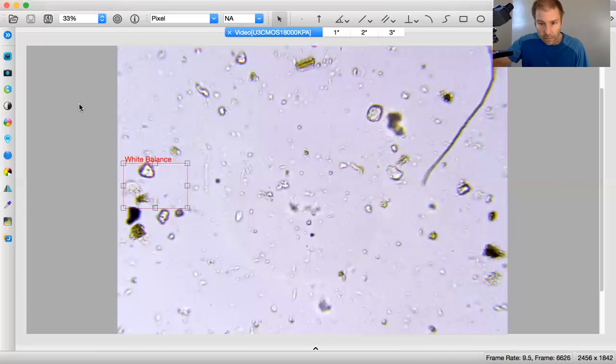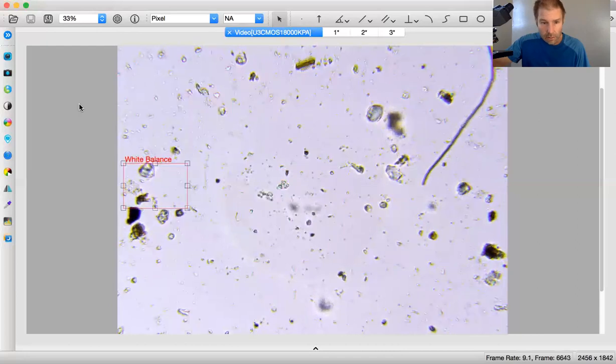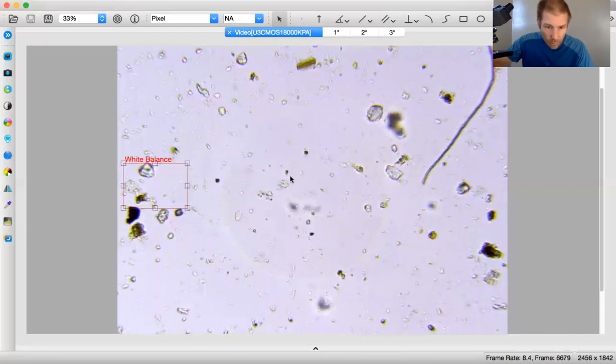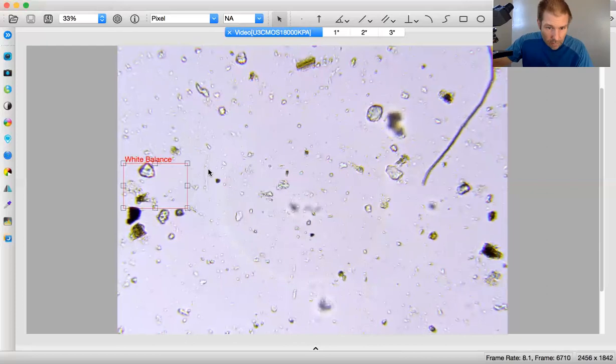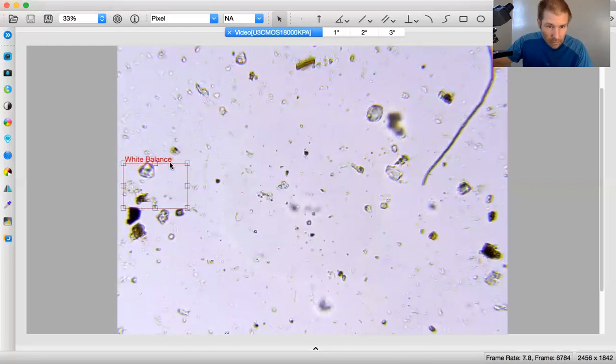We see septa, and we see a 90-degree break on the end. Excellent. And that is this right here. I'm using my mouse now. I also see that's organic matter, I want to say, and that looks like actino right here.